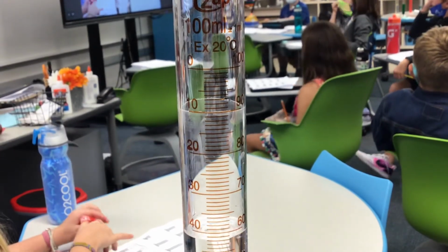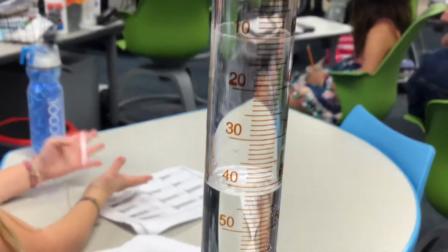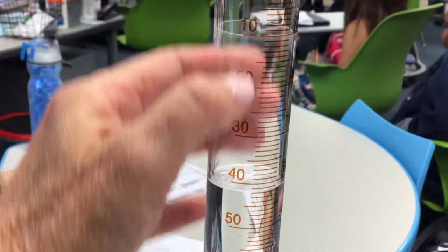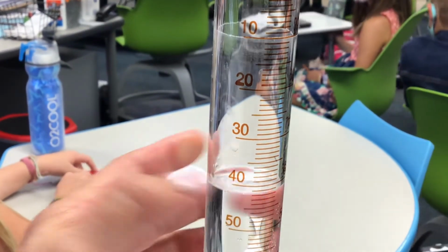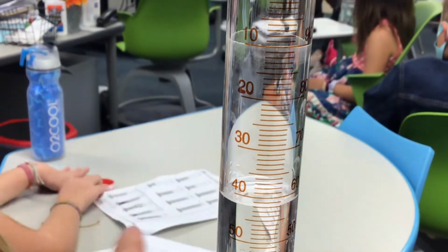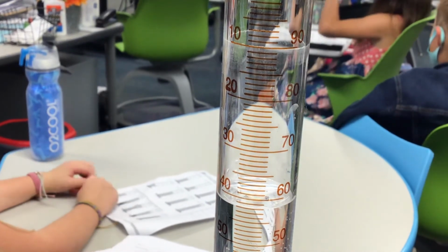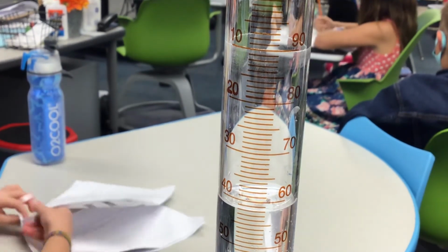Which number would tell us? When we look at this amount of water, how do we know which side to use? Is it 44? If I count from here, it's 10, 20, 30, 31, 32. I'm sorry, 42. Or is it over here? Is it 58? How do I know which one to use? Stella? Because the 40 is right there and the 50 is right there. So it's under the 40.